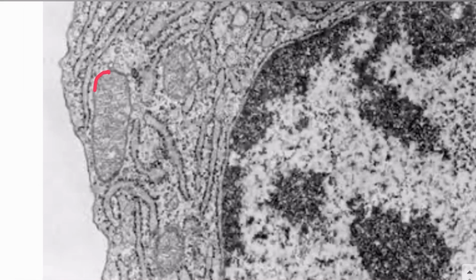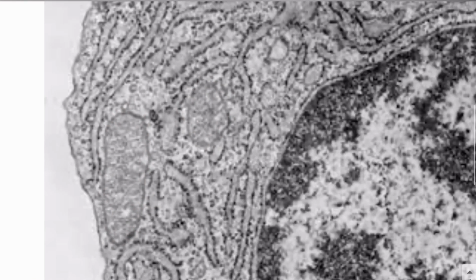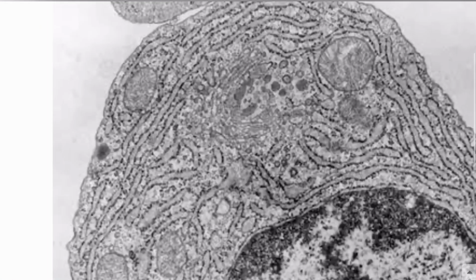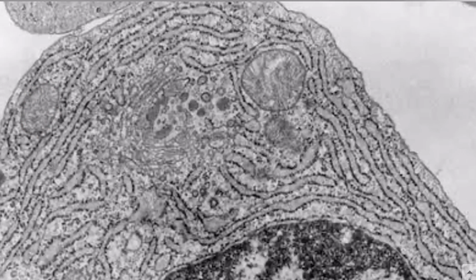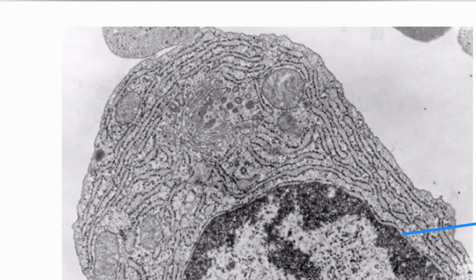So guys, this is the structure that we can see, and more such structures like this. These structures are mitochondria. How do you recognize mitochondria? Mitochondria will have a sausage shape or an oval shape or spherical shape, right? This is an oval shape. This is kind of spherical, and this is kind of long, sausage-like. So these structures are the mitochondria.